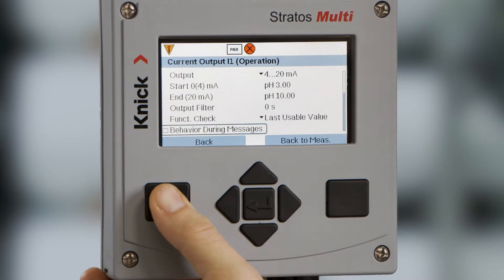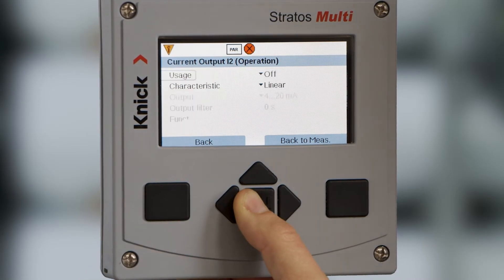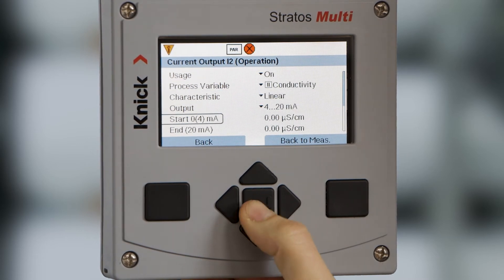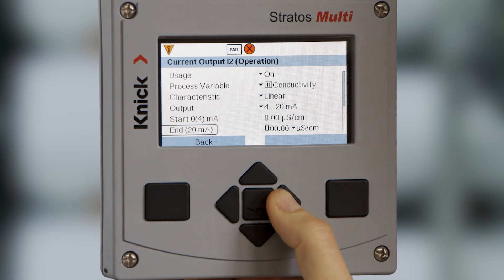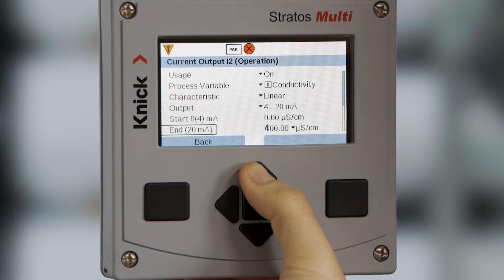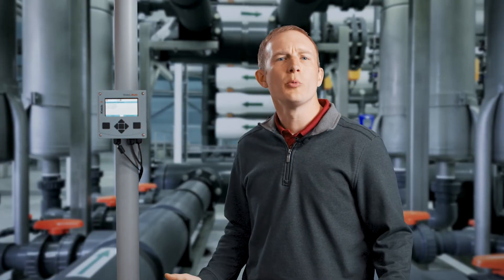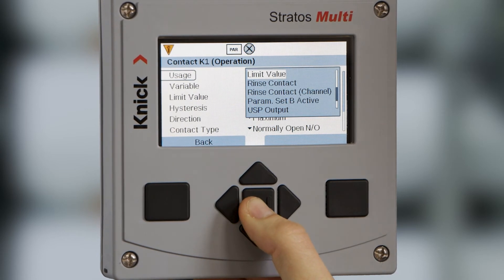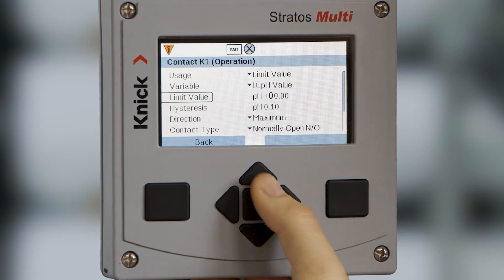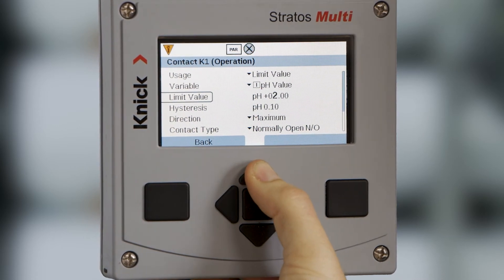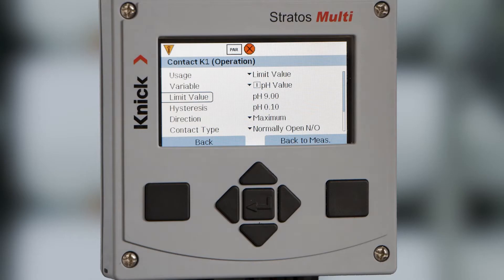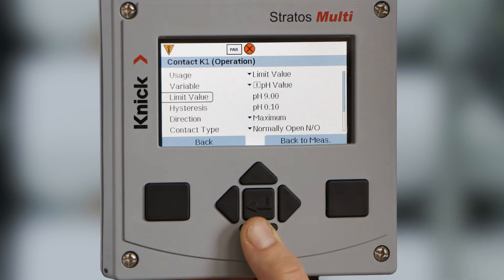Let's back out of output 1 and continue configuring output 2 for conductivity from 0 microsiemens to 500 microsiemens. Next, we will set up our relay contact K1 for a high limit value of 9 pH. As you can see, we can define our hysteresis, the normal state of the contact, as well as any on/off timing delays for the relay.